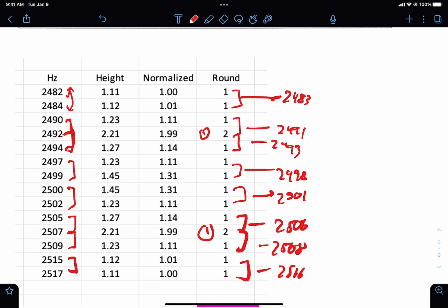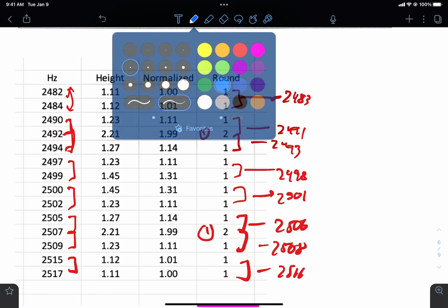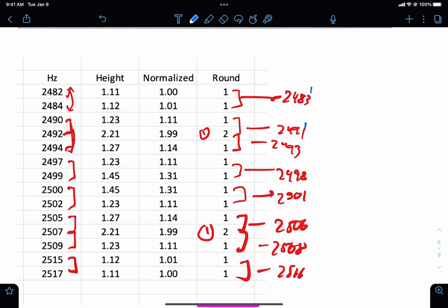Okay. And notice that since we were able to disentangle a couple of these doublets and find that they were overlapping, everything is really a 1. So we're going to treat these all as 1s. The resulting centers are also 1s. So that's a 1, that's a 1, that's a 1, okay, etc. I'm not going to write them in. We can recognize that they're all 1s.